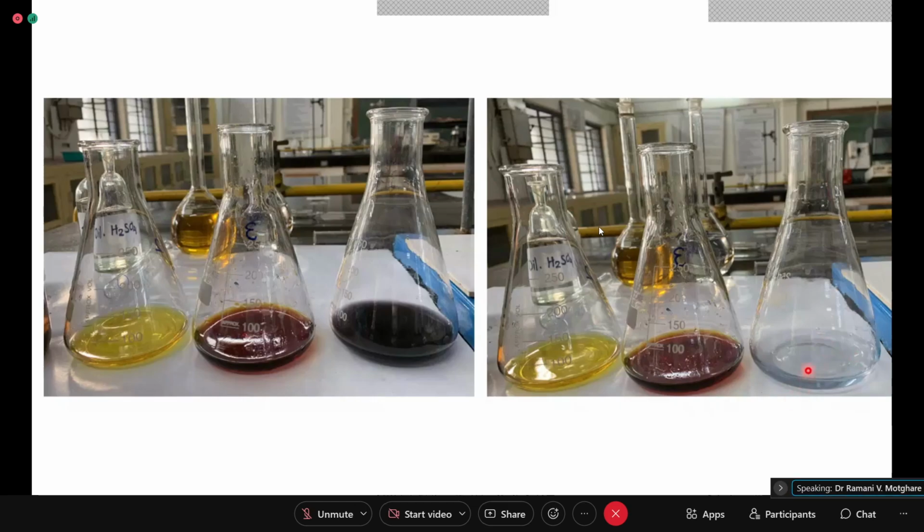So when you are using this dichromate, after iodine is released, you make it pale yellow. After pale yellow, starch is added, so this is with starch. At the end point, when you add the thiosulfate solution, this dark blue color turns to this colorless solution, but it has a sky blue tinge to it due to chromium. Okay, so this is regarding standardization.